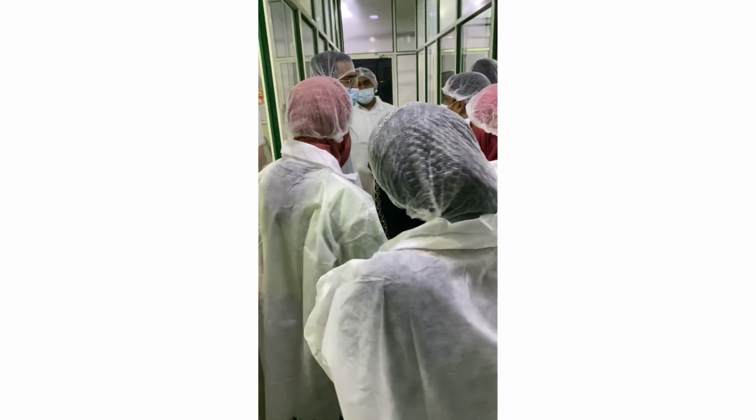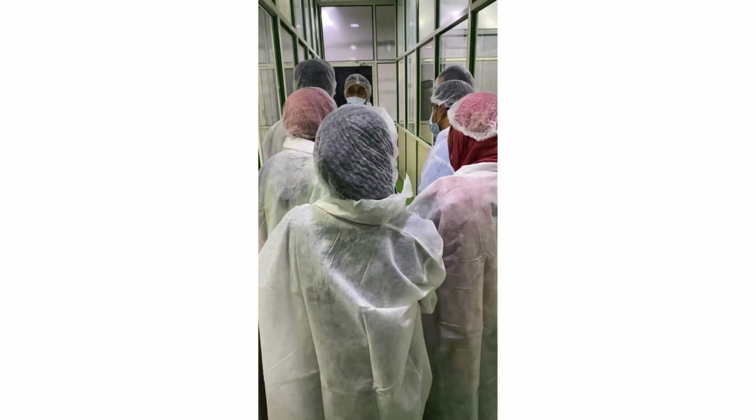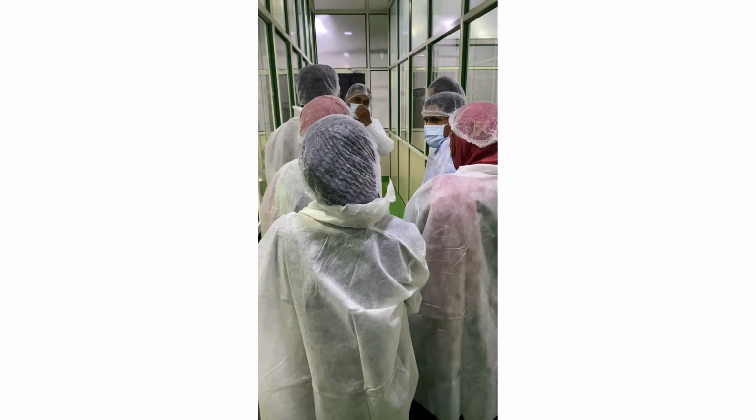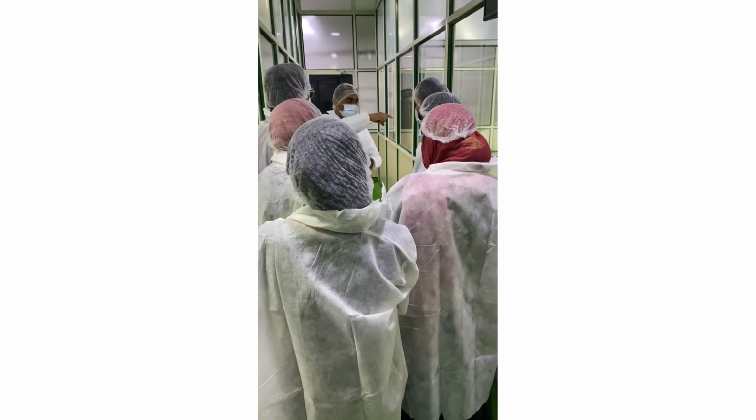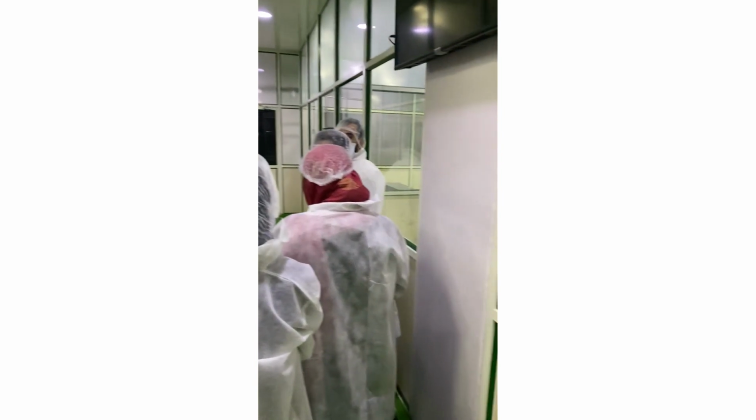The juices, iPulse and iCare, will be heated to 92 degrees. Then it will be cooled to 72 degrees, and before filling it will be 60 degrees. So the temperature comes down. All of this will be displayed here.